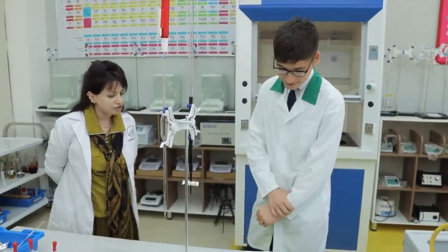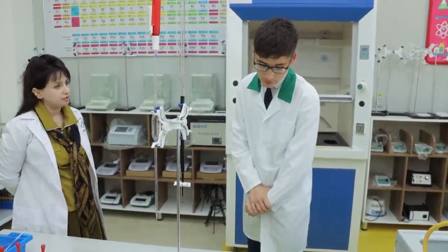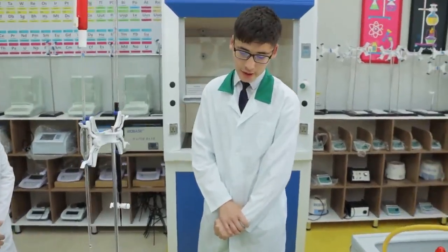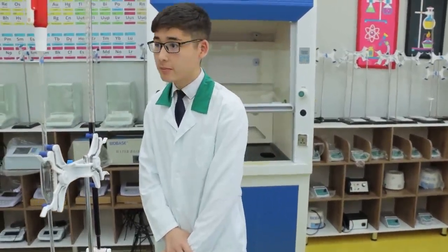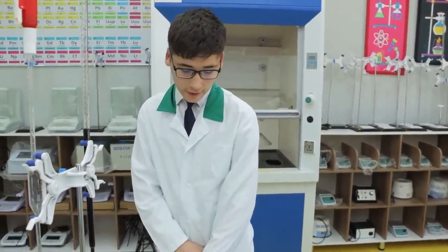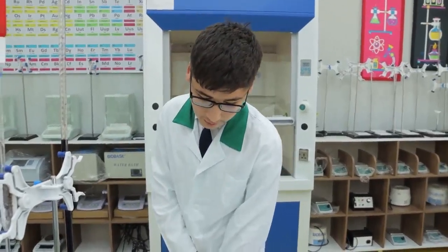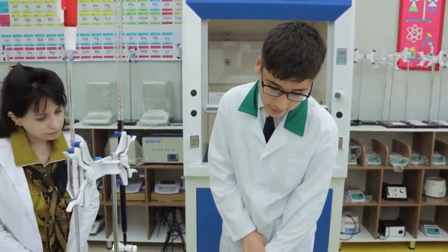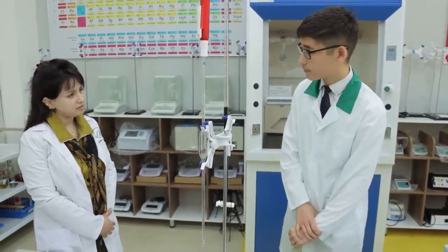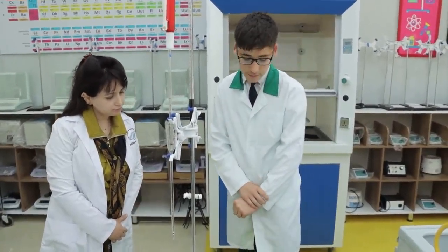Yes, they are what you have measured and manipulated and observed in question number 2 of the titration. In question number 2 of titration, I want to know the concentration of the hydrogen peroxide by the use of the titration. We had a standard solution which was potassium manganate. What is the concentration given to you? 0.018 mol/dm cube. Okay. You're going to standardize this against the titration to find the hydrogen peroxide.